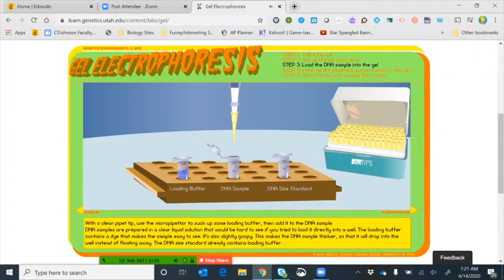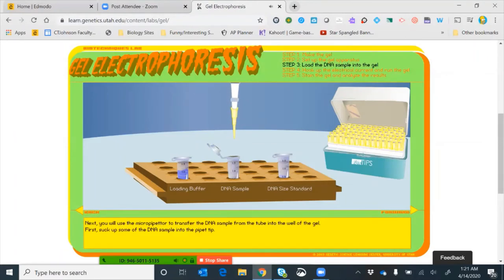This sample already has loading buffer added. Next, we use the micropipetter to transfer the DNA sample from the tube into the well of the gel. We suck it up — changing tips between samples — and grab some DNA sample, ready to load it into the well.